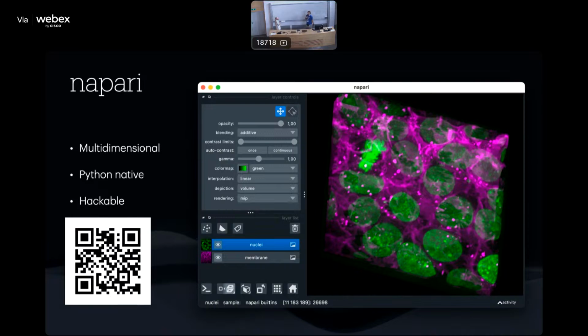Not so many people know napari, so maybe you have something to add to introduce. Well, we're going to go a bit more into detail on the interface in a moment. The general idea of napari is to be a highly hackable, interactive interface with your imaging and imaging-related data, so that at any time you should be able to access the data both from a graphical interface and from a programming interface in a seamless way.